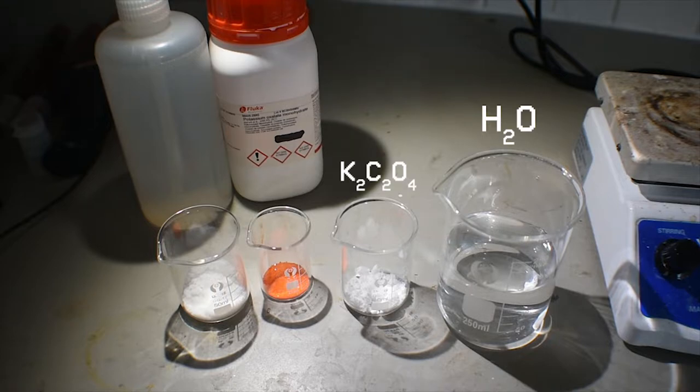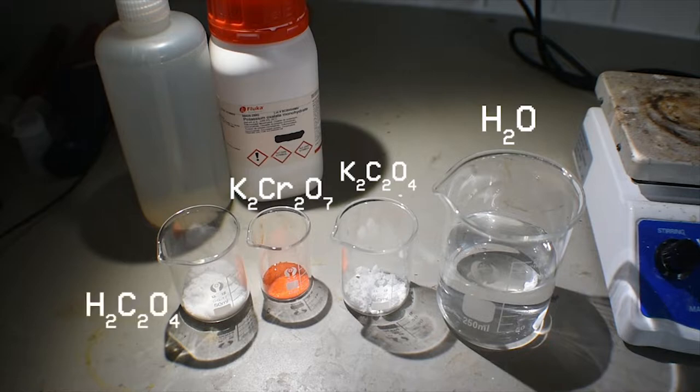We will also need 3.8 grams of potassium dichromate, you can see that, the orange solid right there, and finally 11 grams of oxalic acid dihydrate. So, let's get started.